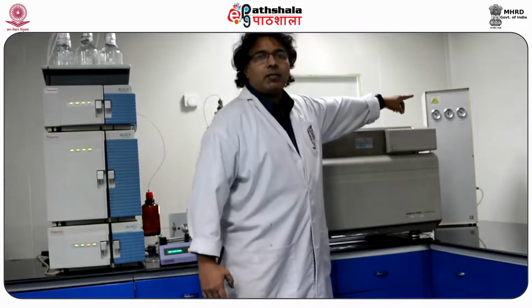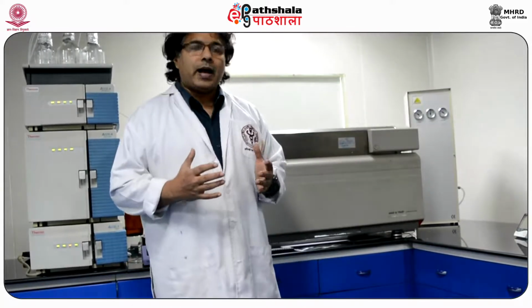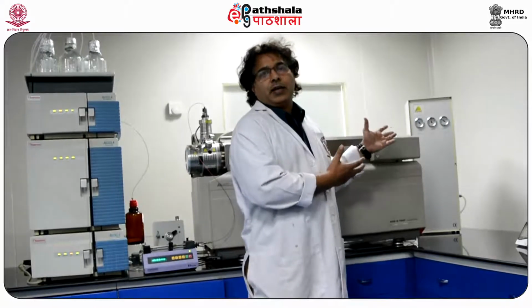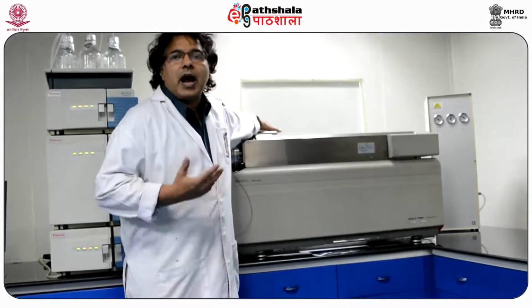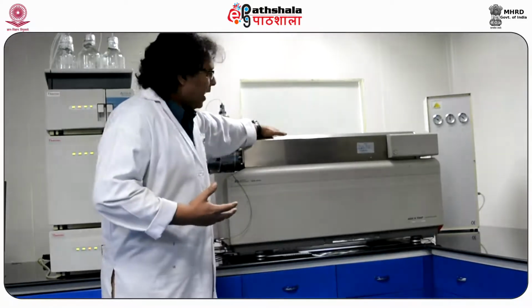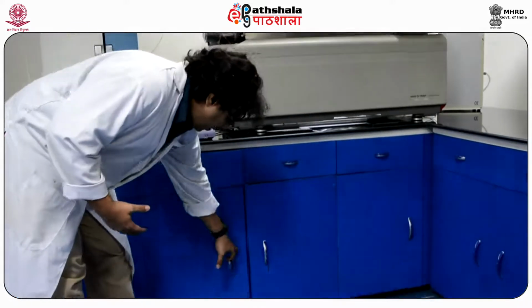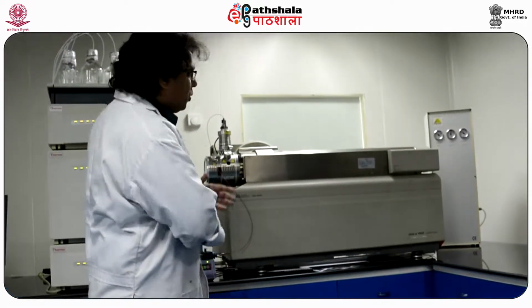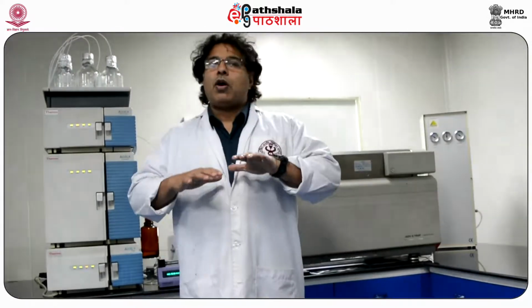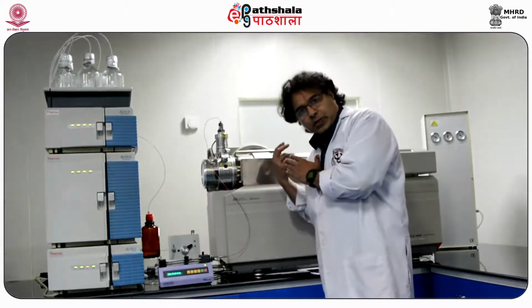What you see on the extreme left corner is the nitrogen generator, in which nitrogen is continuously generated from the atmospheric air. And nitrogen is supplied at various positions here. What you see here is the turbo pump, which tries to create a very high dynamic vacuum. This vacuum is continuously going on, and there is another instrument kept here, the vacuum pump, which gives a static vacuum. Together, they maintain the conditions which are essential for the travel of ionized species inside this mass spectrometer.